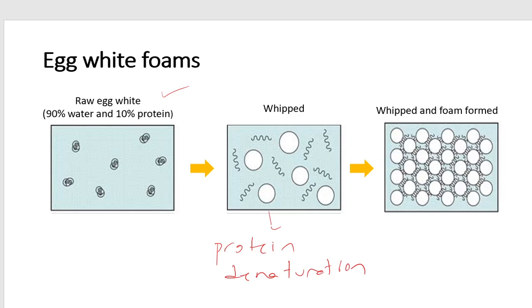And in the third recipe, we have butter. So lipids are more surface active than proteins, and they adsorb to the air-water interface. Therefore, butter has an inhibiting effect on egg white foam formation. So it decreases the foam capacity.